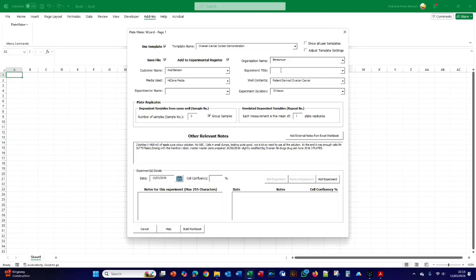And finally, the experiment title. So I am going to call this an ovarian screen. I'm going to say this was patient 8675309, which has an obvious link to the Jenny Jenny song.